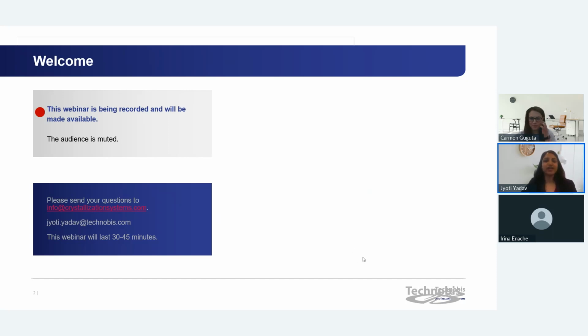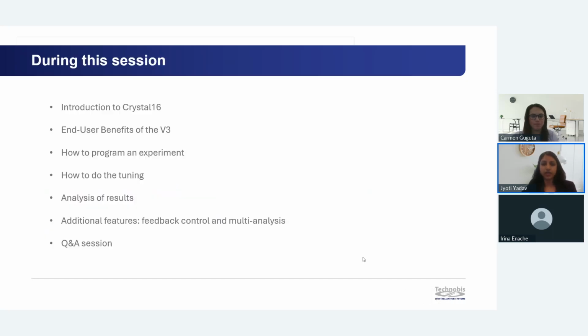Hello, everyone. As already introduced, I'm Jyoti, application specialist from Technobis Crystallization Systems. And today I will be taking this training session on Crystal16. So welcome to all. The aim of this webinar is to help you make most efficient use of your instrument, Crystal16. And if you have the latest version, V3, and if you have the older version, V1 and V2, this webinar will give you an idea what to expect by upgrading the instrument and what are the end user benefits.